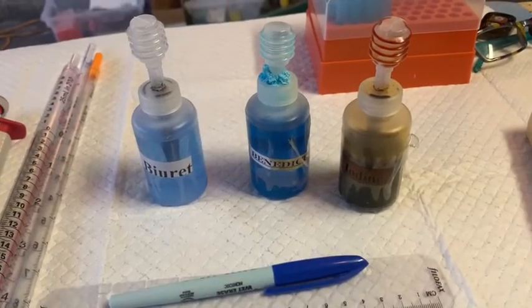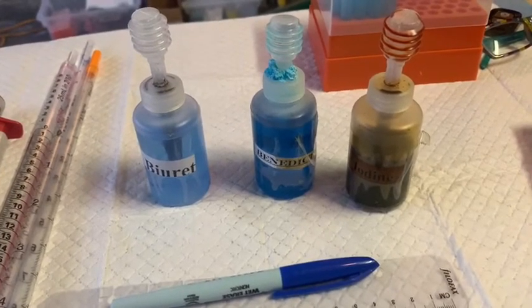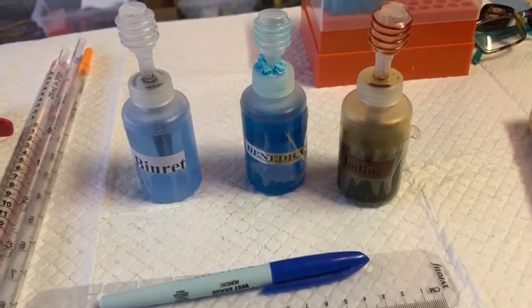The tests that we're going to do are going to be the biuret test for proteins, a Benedict's test which tests for reducing sugars, and an iodine test which tests for starch.